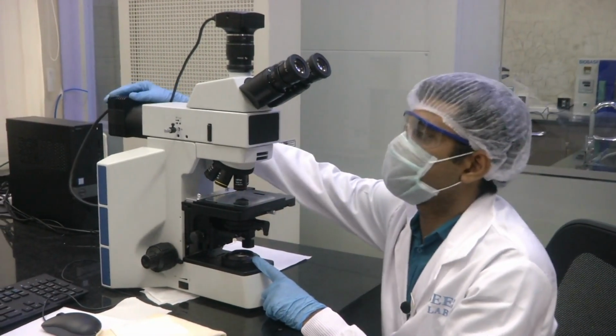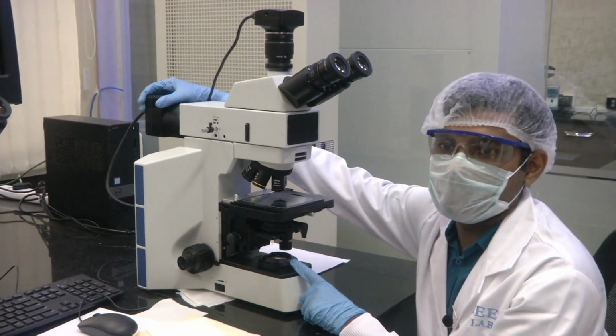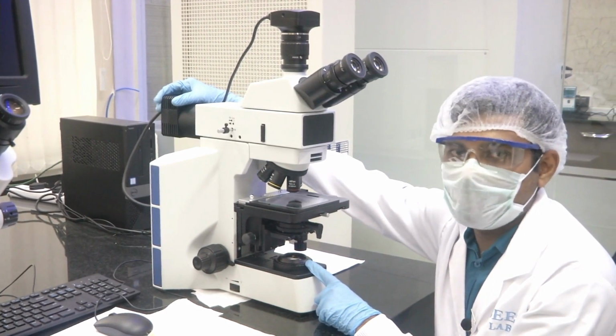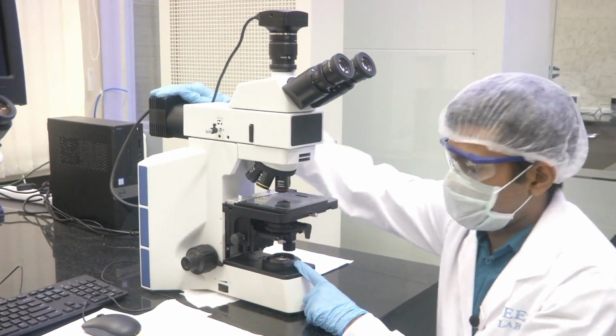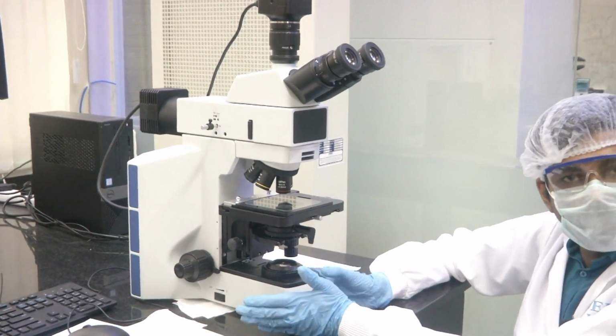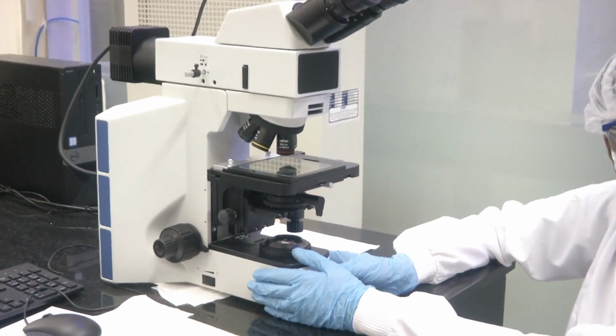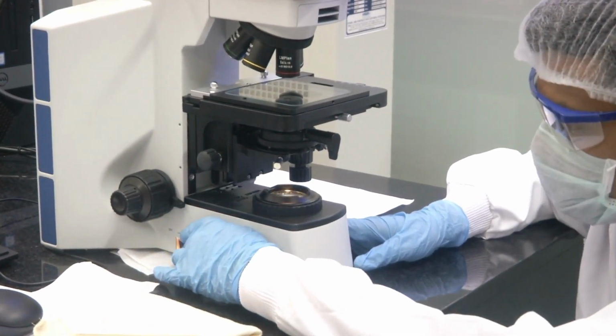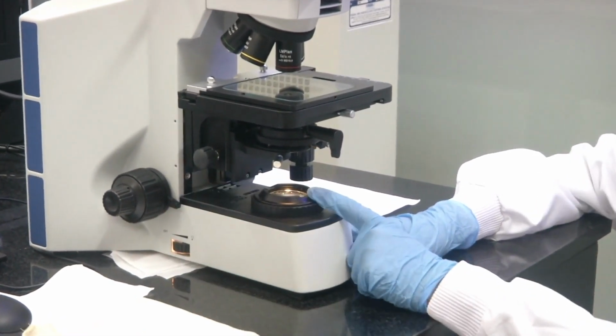There is a top light source here. This black knob at the back of the microscope is the light source for the top illumination. And there is an arrangement at the bottom where you have a bottom light source. Let me just switch on the bottom light source for you. See, now you can see a light glowing here.